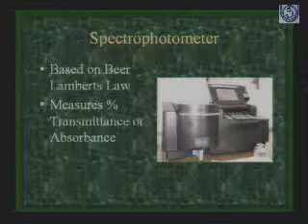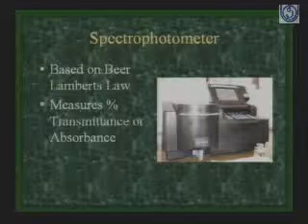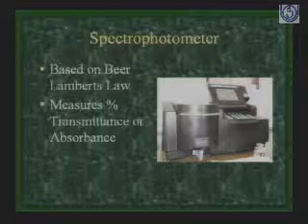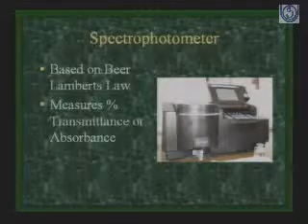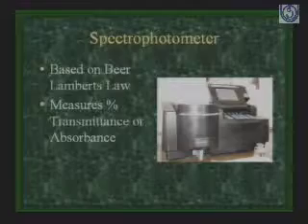Similarly, there are other methods of measuring the color, like the tintometer. What happens in a tintometer? Standard color plates are available, in circles, with the standard colors. Like you are going to measure the color of a beer sample. You put the beer sample in the cuvette and put it into the tintometer cell and rotate the standard, and once the standard is matched with the beer sample, you can say it matches with this LBU color and you note it.